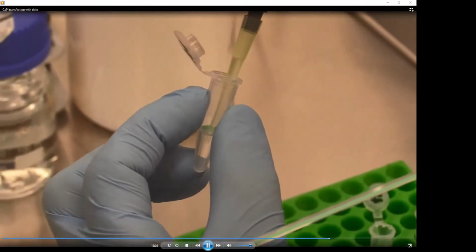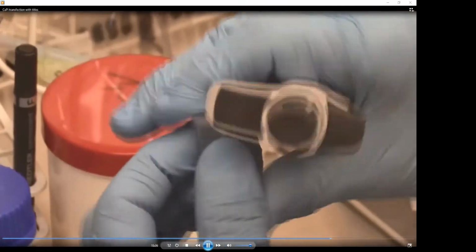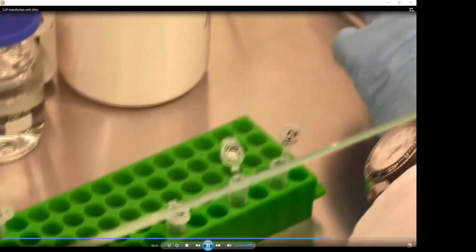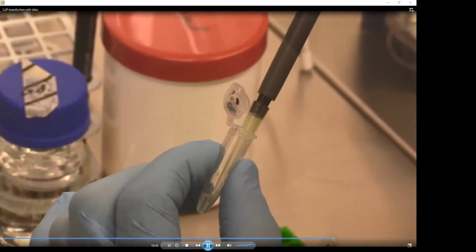Okay, so this is done 15 times. Mixing of the sample. This has to be done with all samples naturally.